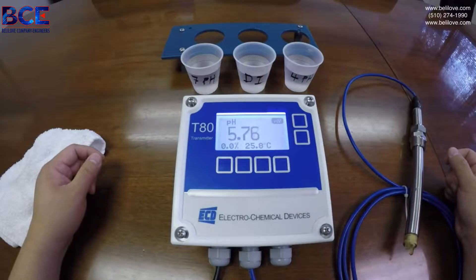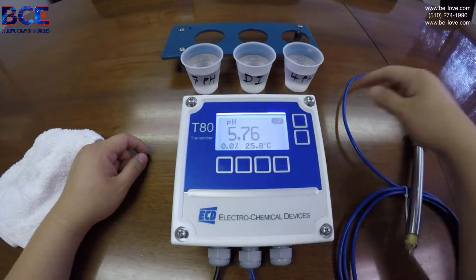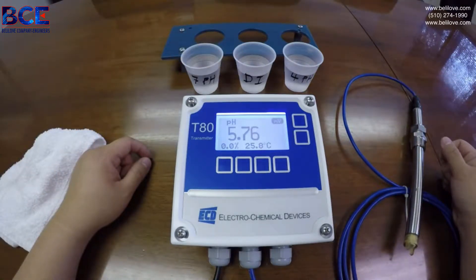Welcome to Electrochemical Devices. Today we'll be calibrating pH with the T80 Universal Digital Transmitter. You will require 7 pH buffer, DI water, and 4 pH buffer. If no DI water is available, simple tap water will be fine.